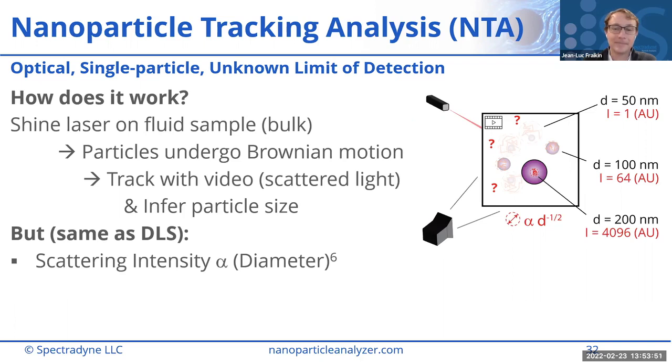Thank you. I was wondering about a way to catch particles that are less than 50 nanometers. The cartridges we have so far allow us to measure from 50 to 400 nanometers, so that is excluding a large part of your vesicles, right? Because we have some vesicles that are less than 50 nanometers. So I was wondering if you are planning to have any cartridge that can allow us to catch very tiny vesicles. That's a great question.